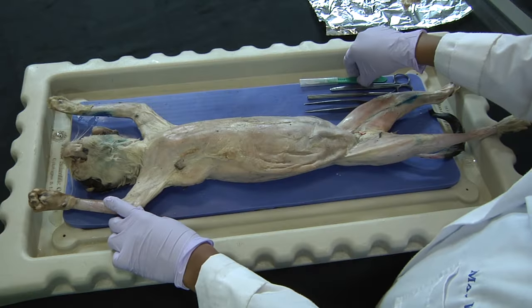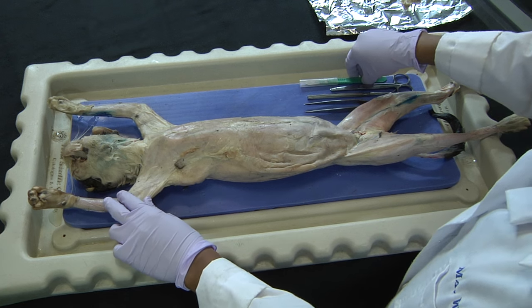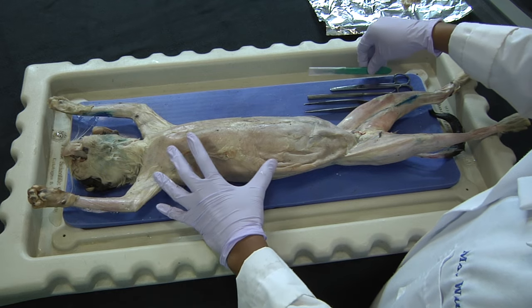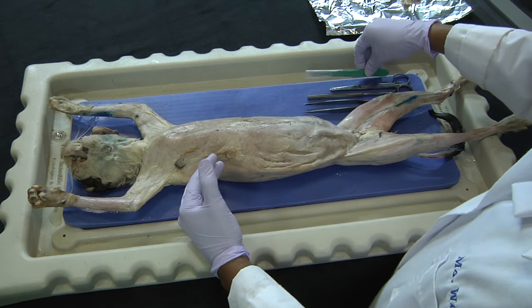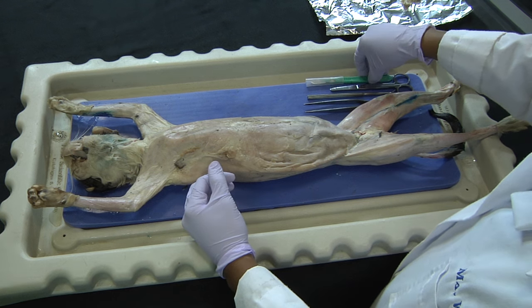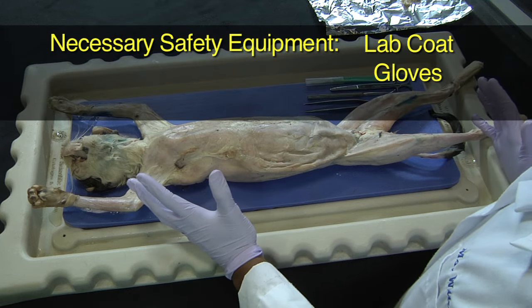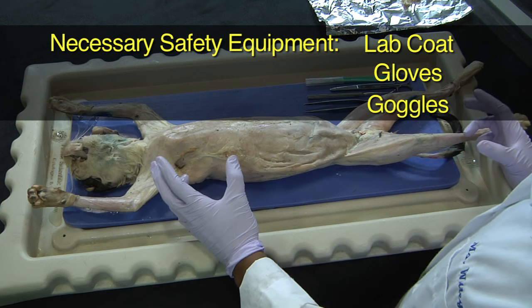Today we are going to conduct a cat dissection, specifically to isolate the muscles in the cat. In order to do this, there is certain equipment that is needed. First, protective equipment, which includes a lab coat, gloves, and goggles.